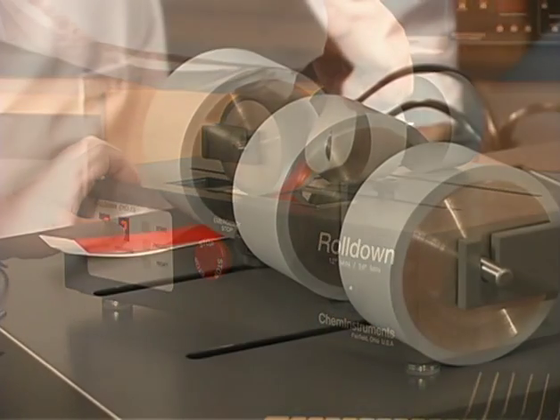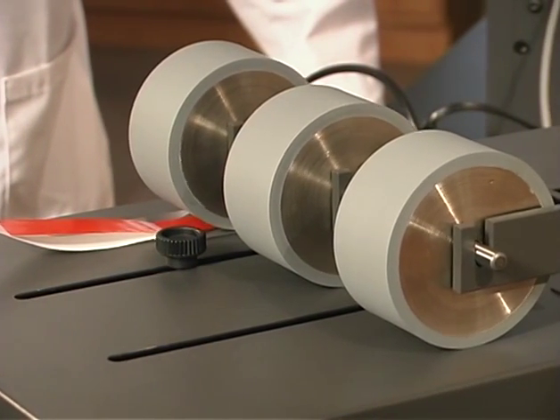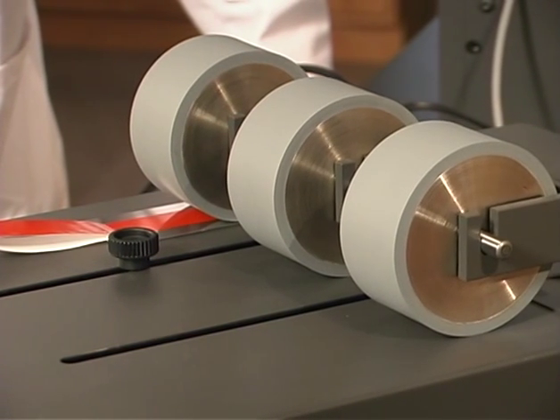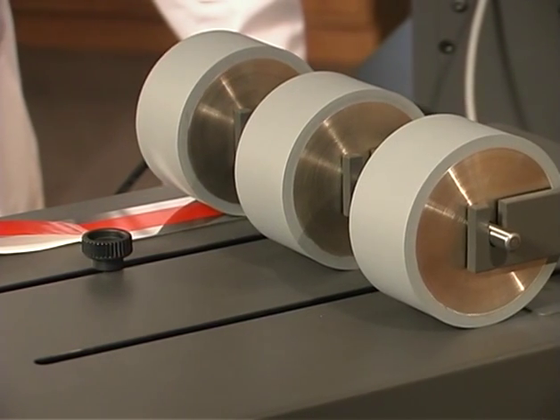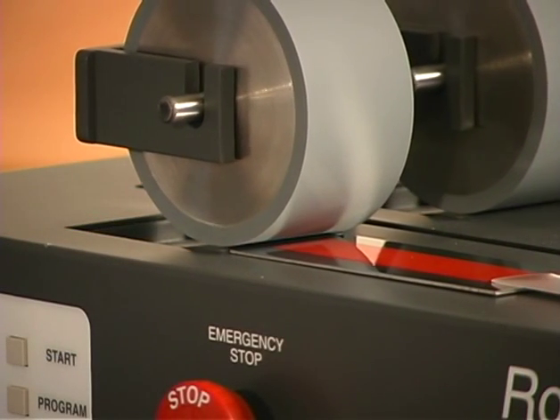However, if you are testing for increased adhesion at longer dwell times, prepare your samples consecutively and allow them to remain untested for the prescribed period of time, then test them in the same order in which they were prepared.